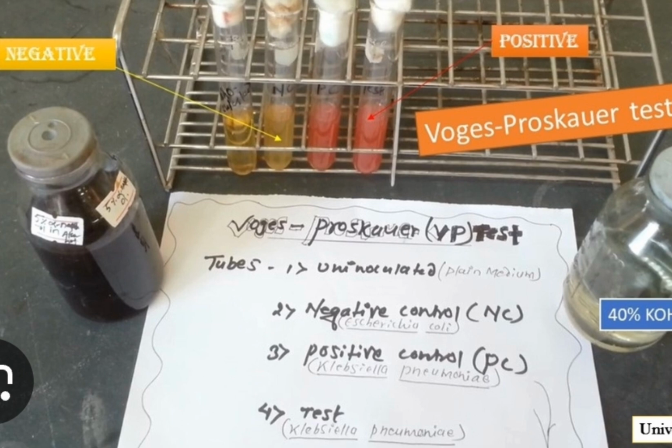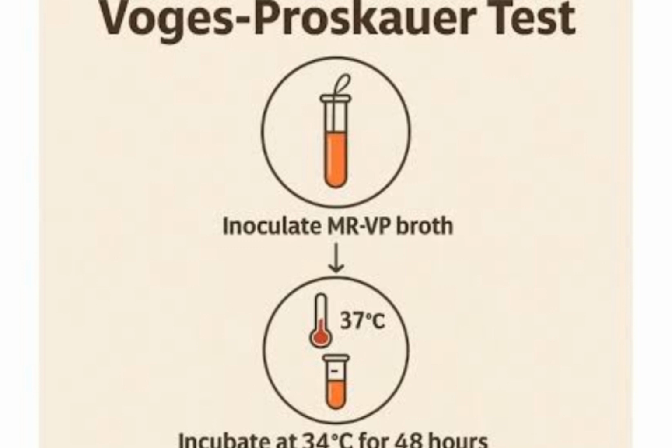If we convert it into diacetyl, then we can test for the presence of that diacetyl using a set of reagents which we call the Barritt's reagent. There are 2 types: Barritt A reagent and Barritt B reagent. The Barritt A reagent has 5% alpha naphthol, and the Barritt B reagent has 40% potassium hydroxide.